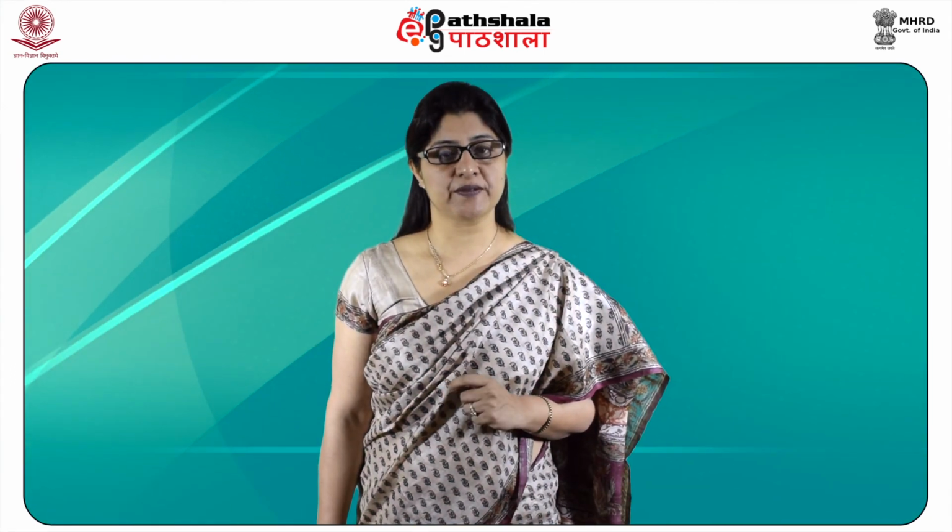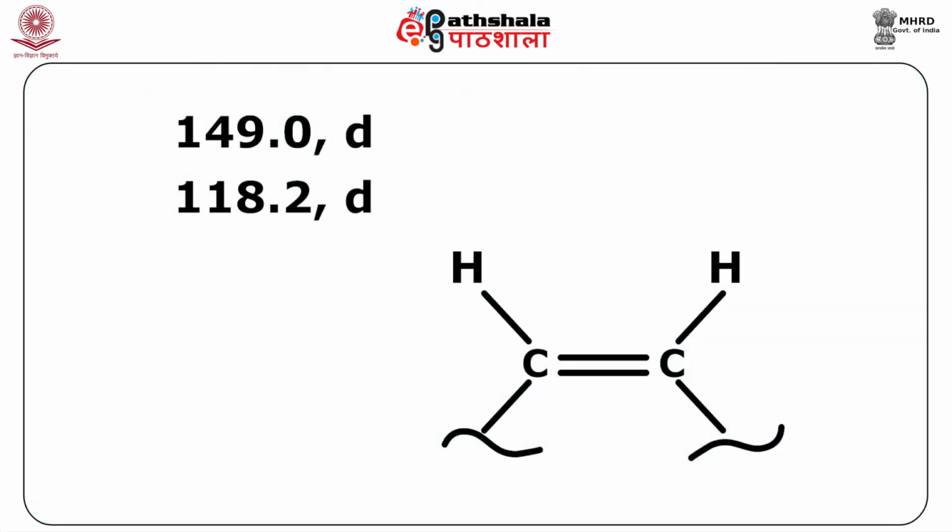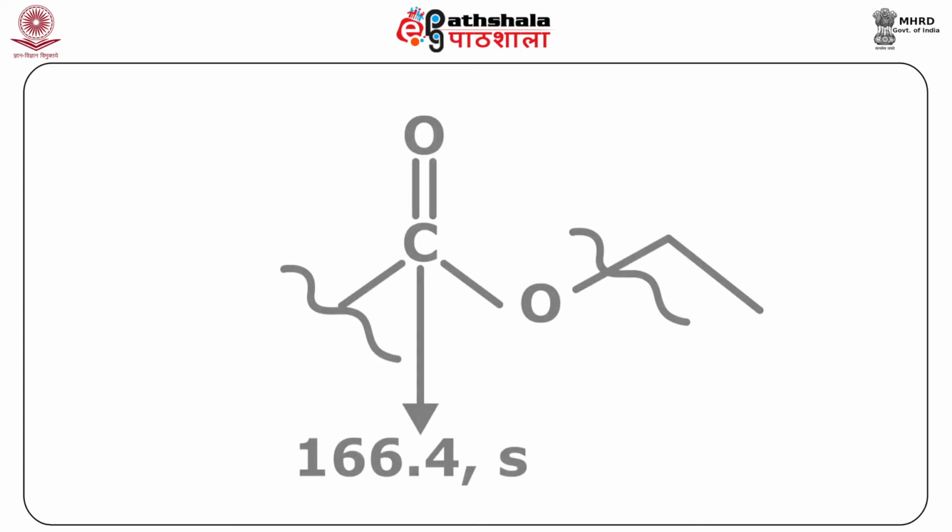The double bond equivalence for the given compound is found to be 2. The substructure associated with the 13C NMR is a disubstituted alkene. It accounts for 1 double bond. So, the structure can be assumed to be CH double bond CH further linked to other substituents. The substructure associated with the 13C NMR is a carbonyl group. This accounts for the second double bond. Therefore, we can assume the structure to be a carbonyl group linked to an oxygen, which in turn is linked to other carbon atoms.